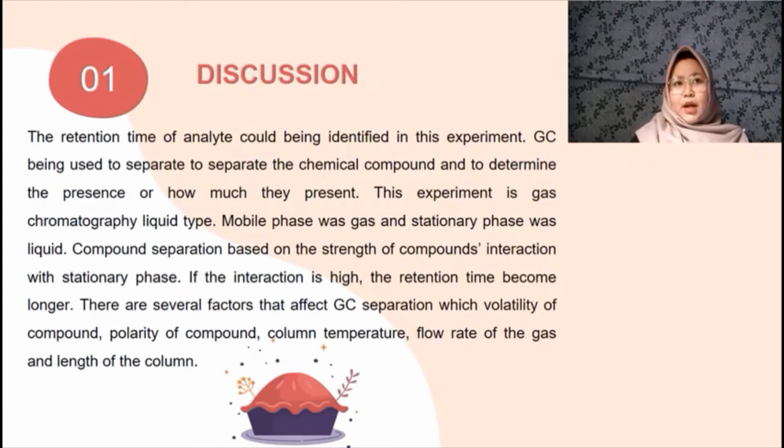This happens because the compound separation is based on the various strength of the compound's interaction with the stationary phase, and the stronger it is, the longer it takes to migrate. In other words, the retention time becomes longer. So, there are several factors that affect the gas chromatography separation.